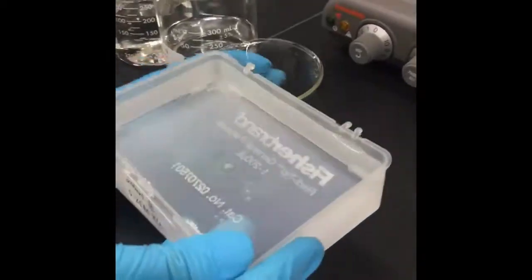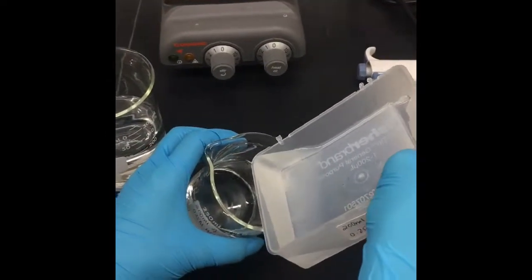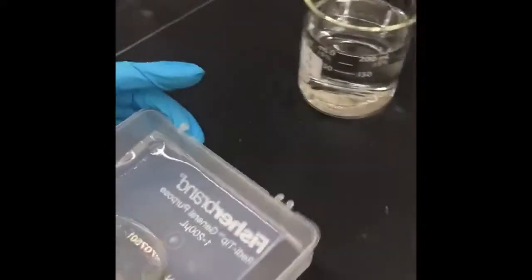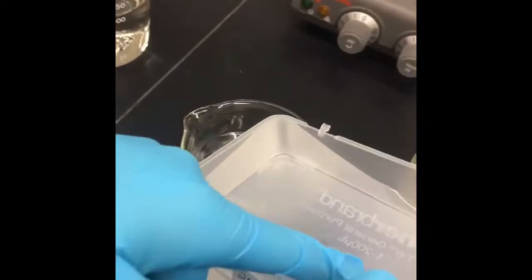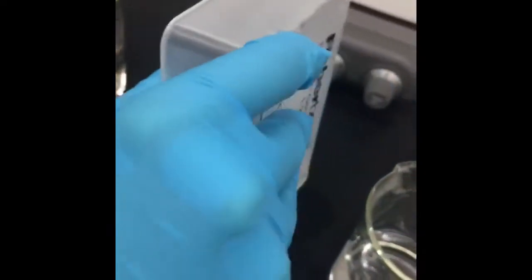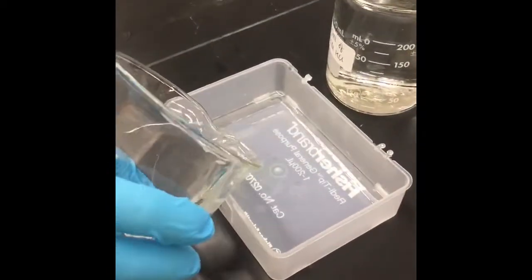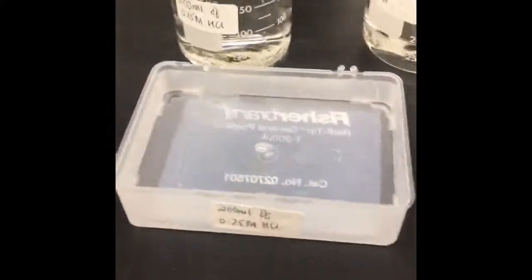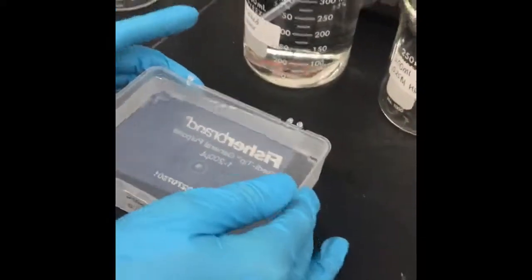After 8 minutes have passed, the HCl is discarded. And the gel is washed 2 times with 200 ml of distilled water. We make sure that the agarose gel is rinsed with several washes. Once the gel is washed, we then soak the gel in 200 milliliters of DNA denaturing solution, known as DDS, for 15 minutes on the shaker. After the 15 minutes have passed, we throw out the DDS.